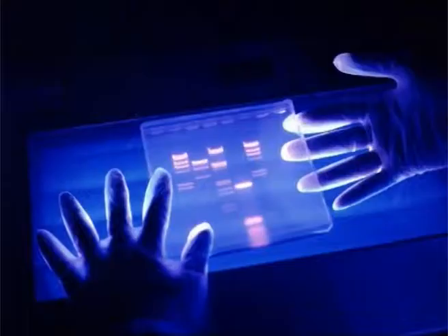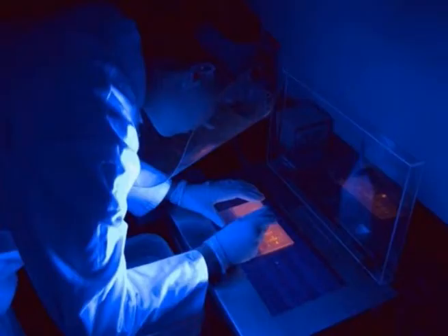Applications of electrophoresis in forensic science. The technique of electrophoresis has been employed in the field of forensics, as it can be used to isolate and compare DNA, blood proteins and inorganic constituents, for example, gunshot residues from the scene of crime, suspects, victims or standard reference material. The technique of gel electrophoresis is used in forensics, molecular biology, genetics, microbiology and biochemistry.